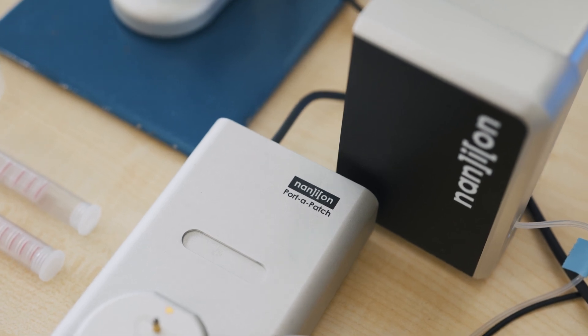The use of the PortaPatch is very straightforward. When you can use a pipette, then you can use the PortaPatch to generate high-quality patch-clamp data.